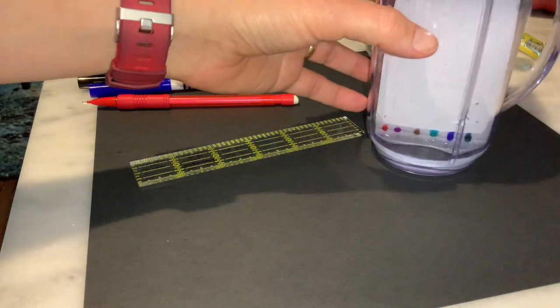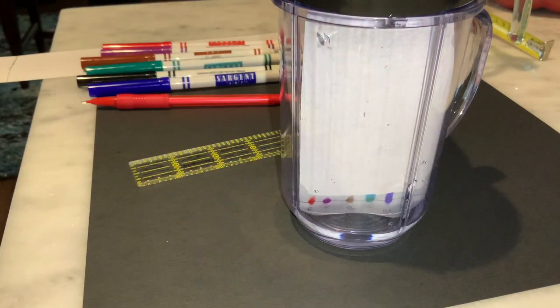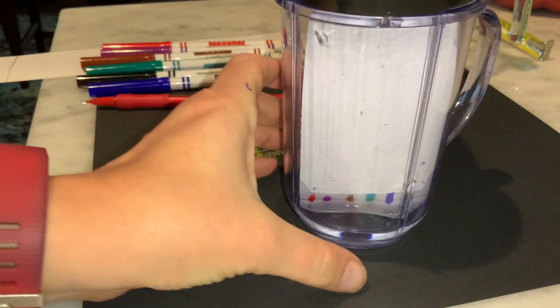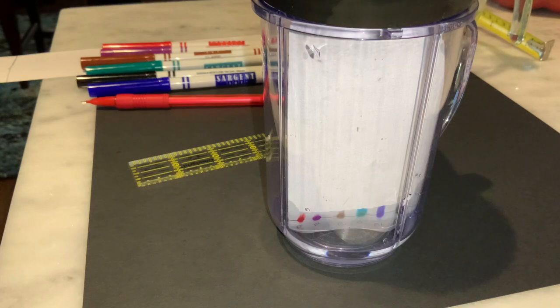So as we can see the water is already moving up the paper and it's taking the ink with it. So we're going to let this sit here and let the solvent move up the paper until we get close to the top.